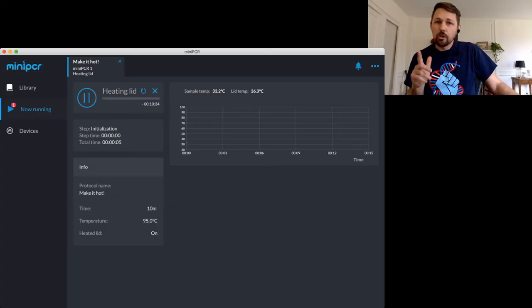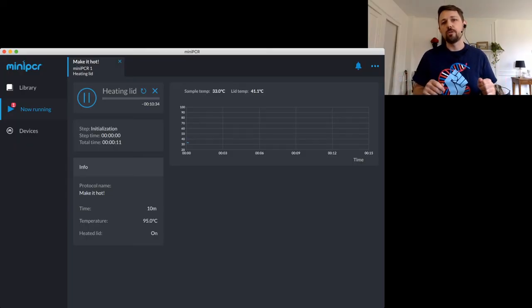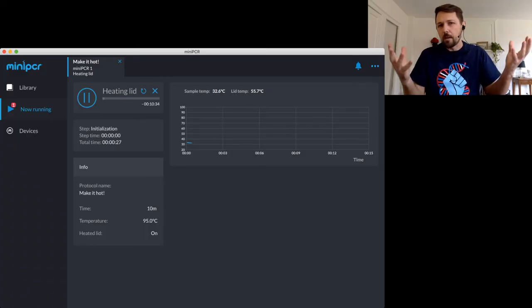So just a real quick note on this, we do a real sort of quick and dirty DNA extraction. If you've done DNA extractions in labs before, you may do a full ethanol precipitation, which involves lots of spinning and pipetting. Ours, we just use an alkaline lysis buffer, so it's got a pH that helps open up the cells, and then we cook it, and that just pops open the cells.